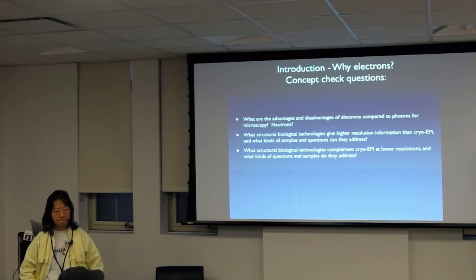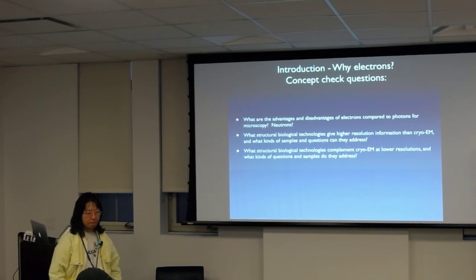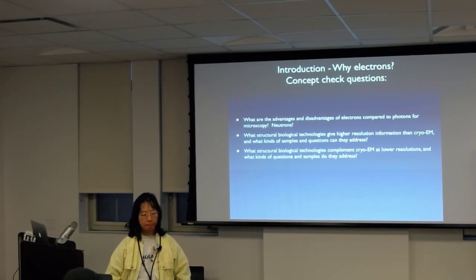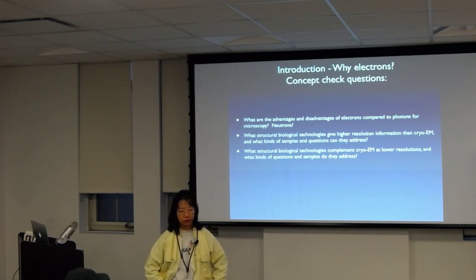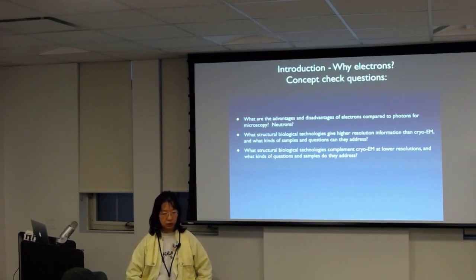Gee, you have a question from YouTube. Yeah, this is from Robbie. He's asking, is a CS corrector a combination of lenses which correct astigmatism? Yes, it's more than just astigmatism. It's all the aberrations that can be described. Many of them can be corrected by what's called a CS corrector or image corrector.